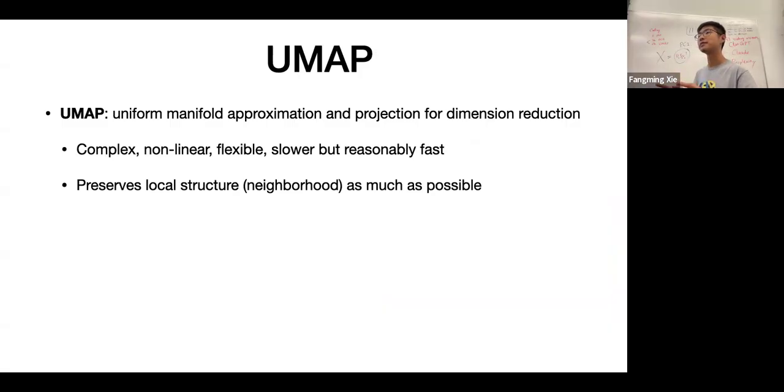PCA runs very fast. You just saw we had 40,000 cells in 400 dimensions. In seconds, it reduced it down to 20 dimensions because people have generated very efficient algorithms to do PCA, and it's all just linear algebra.